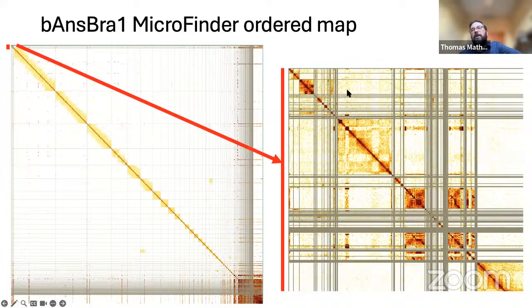And in this picture as well, you can see this elevated gold background signal. For example, if you compare this larger microchromosome here to one of these other candidate scaffolds, you'll see this elevated background signal. If you compare here to the large chromosome to the right, you see this background is much whiter. So there's less contact between this scaffold and this scaffold compared to this scaffold and this scaffold. And this is a classic signal we see of micros, where they're associating with each other.